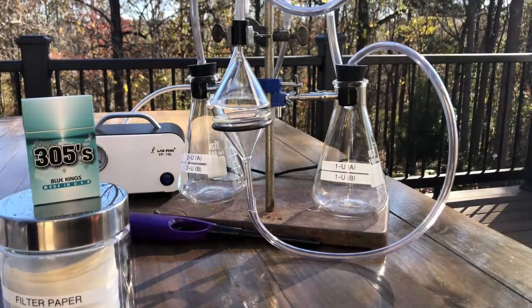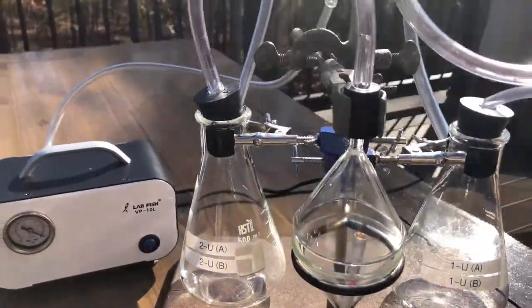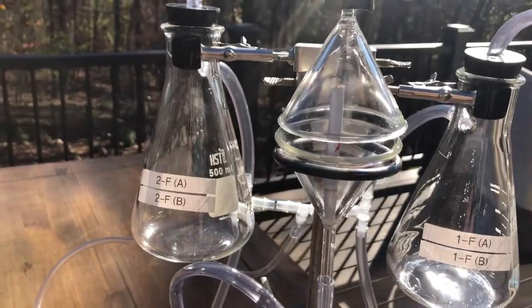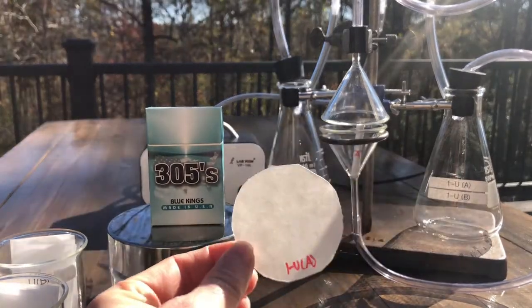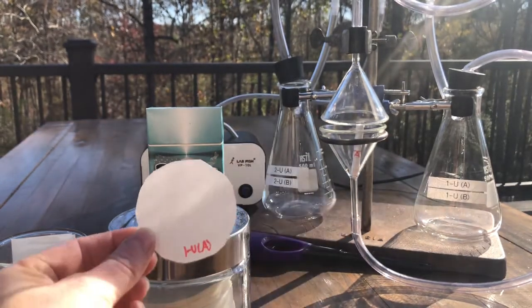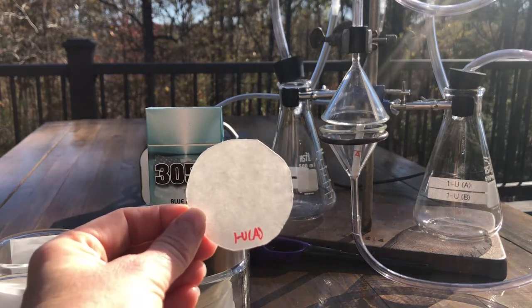Okay, so now we have both of our cigarettes set up. That one tipped over a little bit. Let's see if I can get it to stand up right in there. And now we're gonna go ahead and put in all the filters. So, for example, this is one of the filters. We had to cut them. They're regular filter paper, but we had to cut them down. And this one is for our first-hand smoke, unfiltered, trial A.